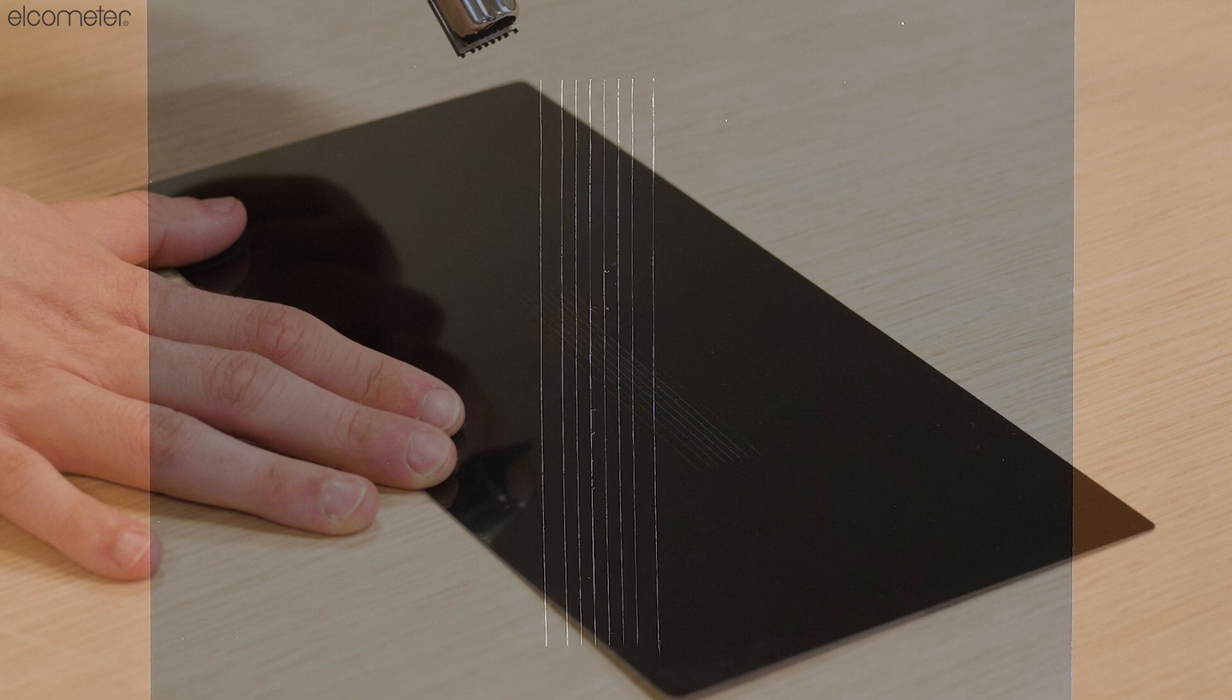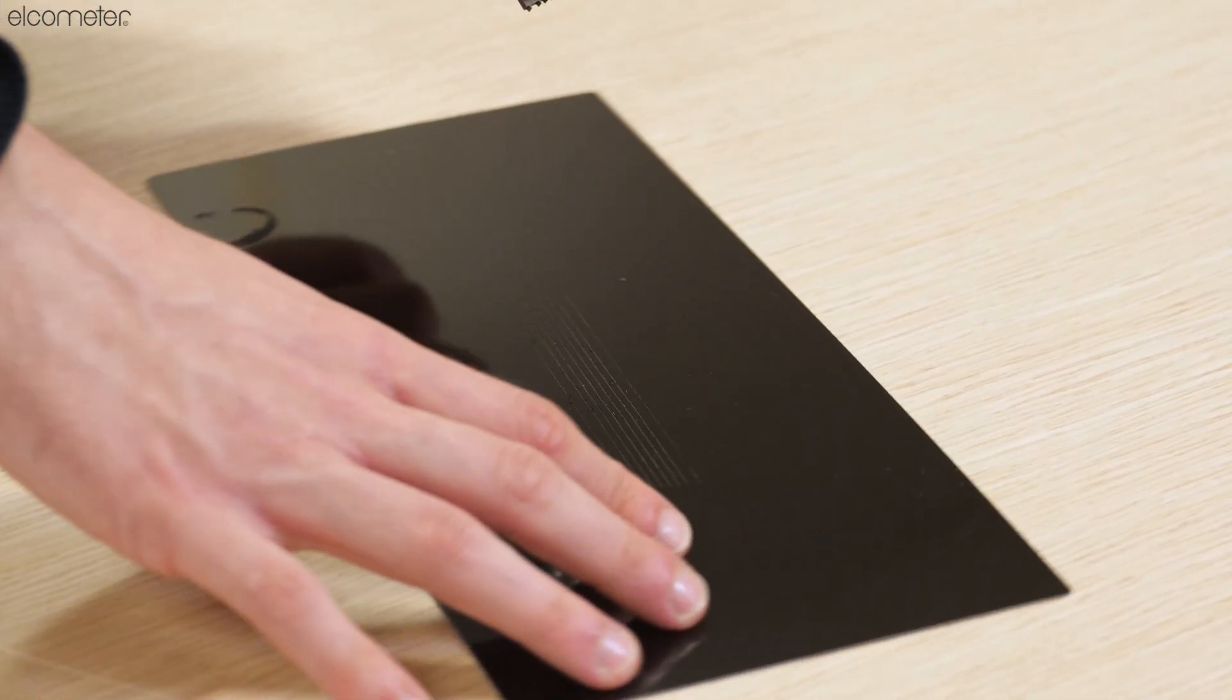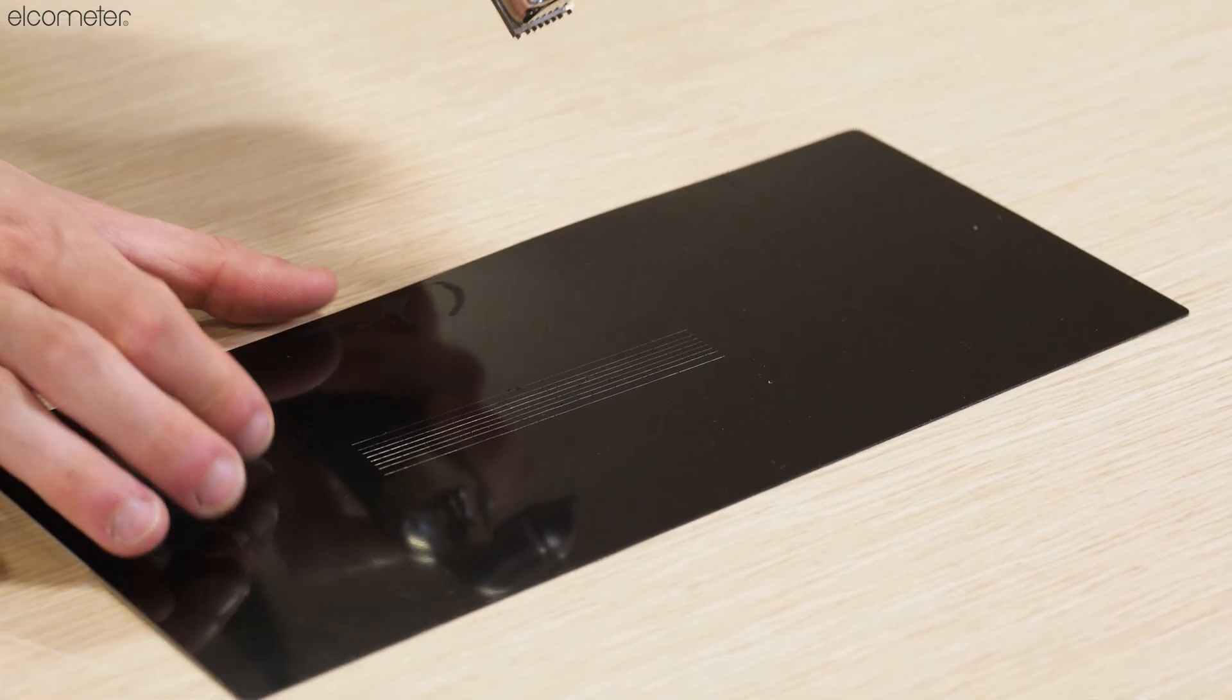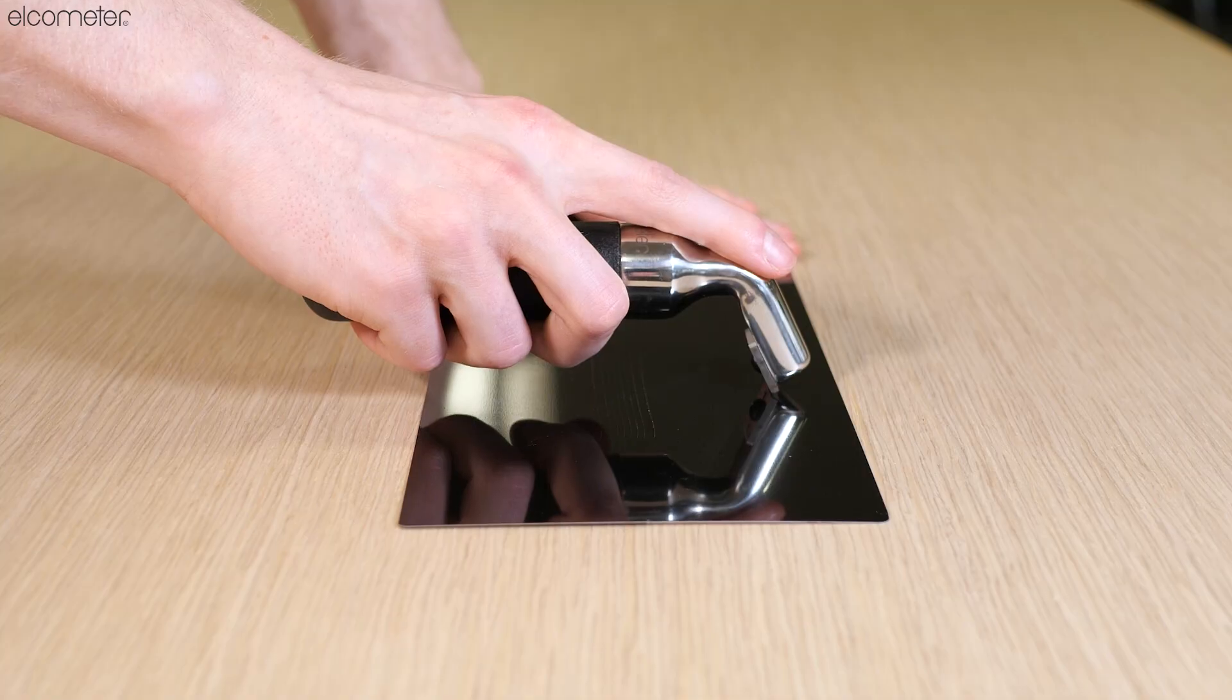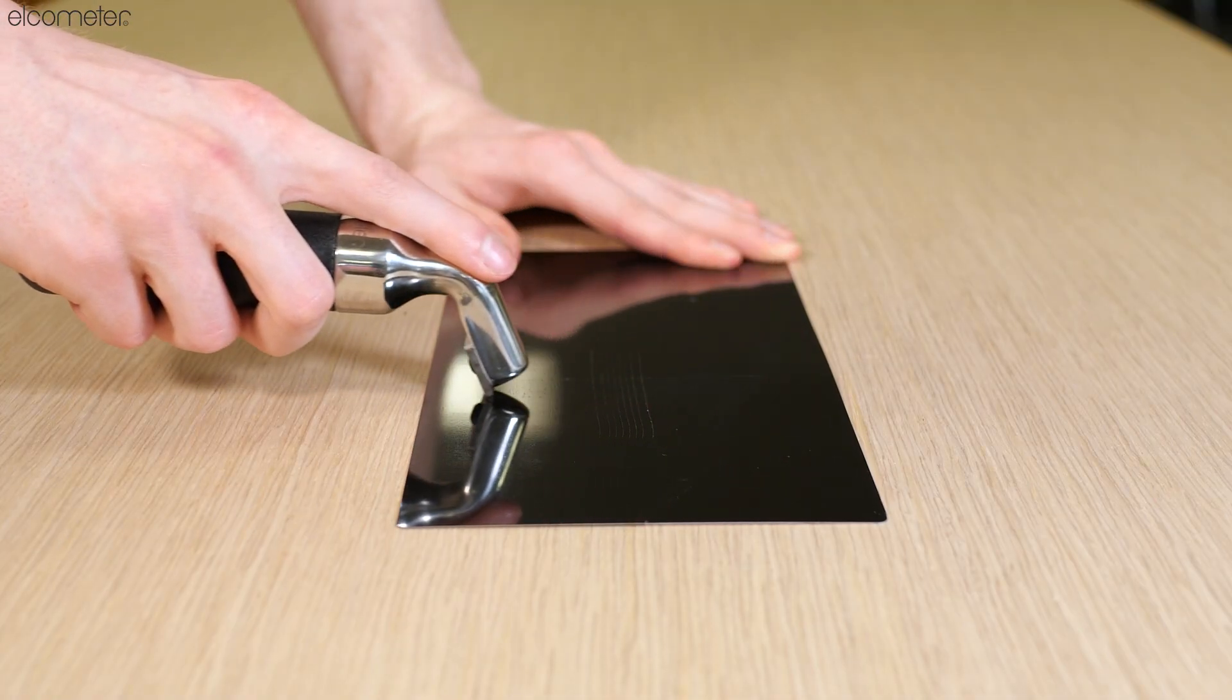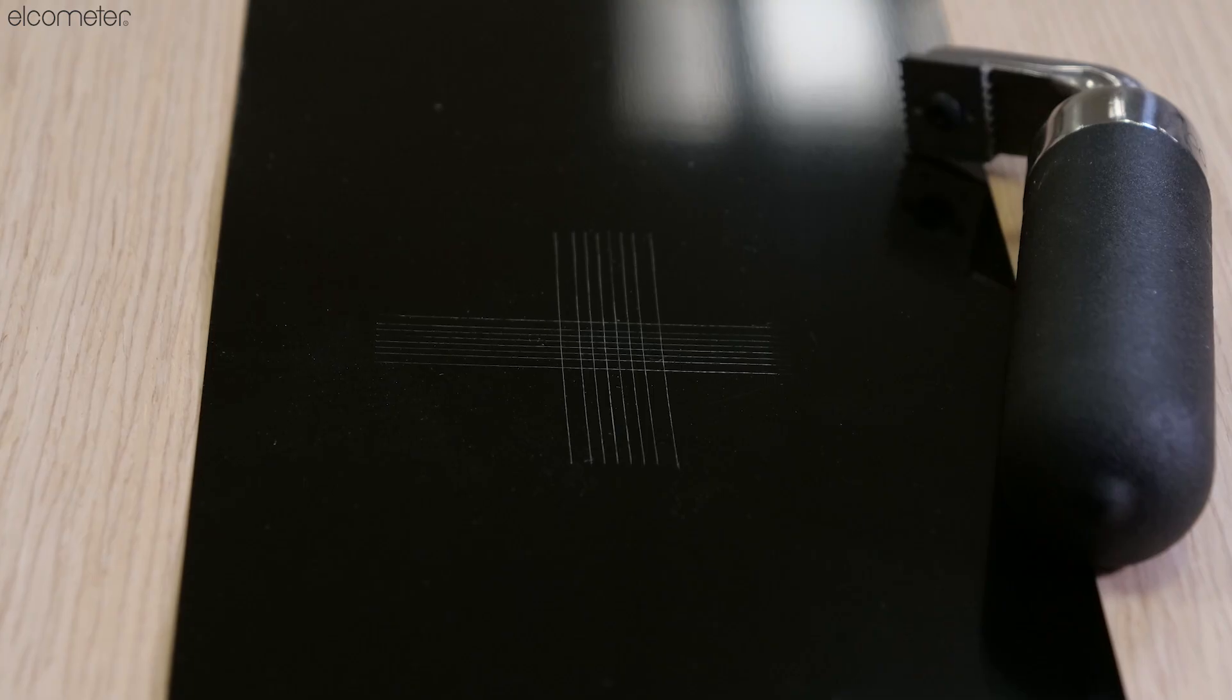Next, reposition the cutting edge on the sample at a 90 degree angle to the first cut and again pull towards you, making another series of cuts so that a lattice pattern is created on the coating.